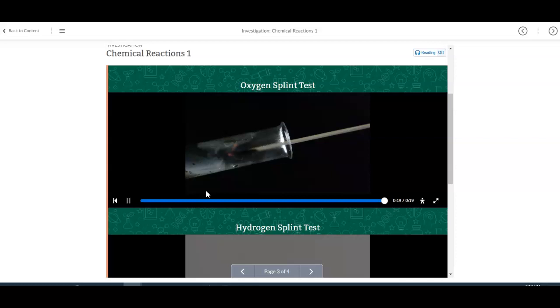All right, as you were able to see, and as we just talked about with oxygen, blowing on a match or adding oxygen to it wouldn't reignite a match, but it could fuel a fire already lit. In this situation, you saw that with the O2 in the test tube. We know that O2 is pure and that the air we're breathing in has other things in it. If you've ever seen someone with an oxygen tank, there are warnings all around them that say do not get near an open flame, so we know that it is highly reactive. In this picture, you're able to see that the match reignited when it was exposed to the O2, the oxygen gas. That's different from the air we're breathing in. So I would write down that oxygen reignited the match.